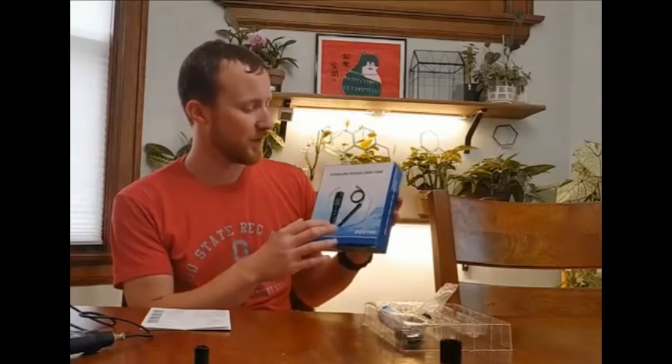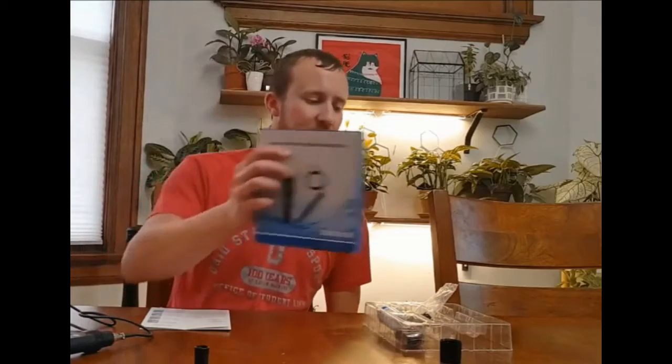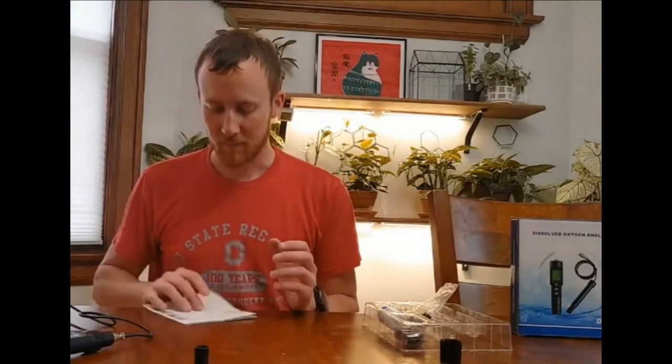Today I want to do a review of the DO9100 dissolved oxygen analyzer meter. This is a pretty nice little meter here. It's a pin-type meter.